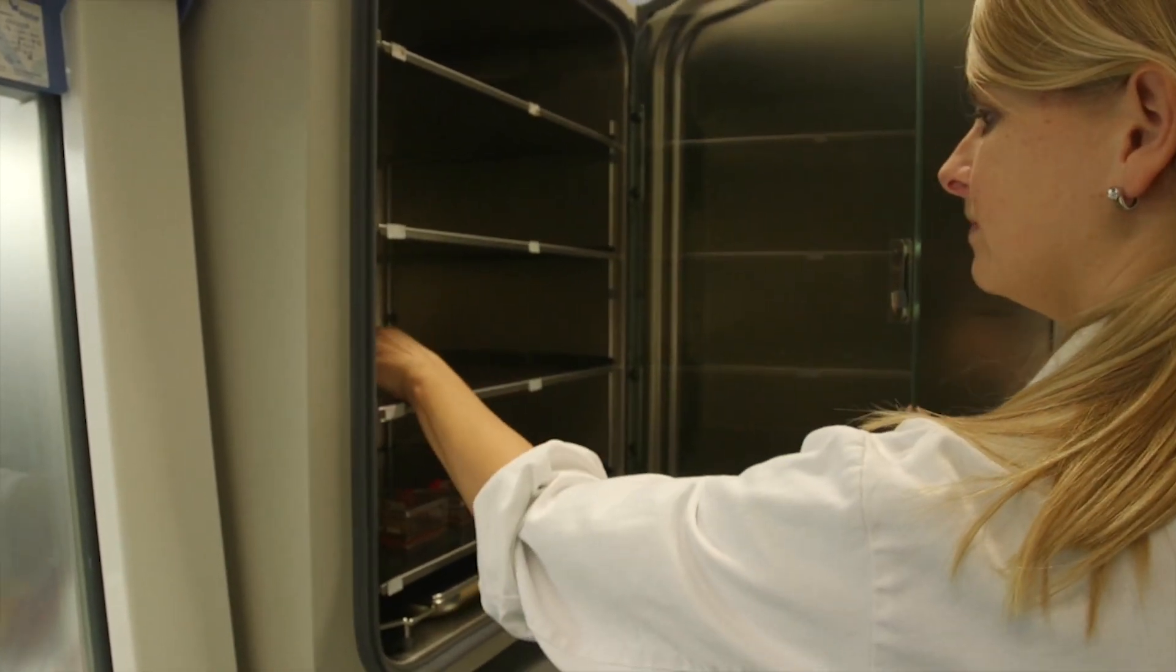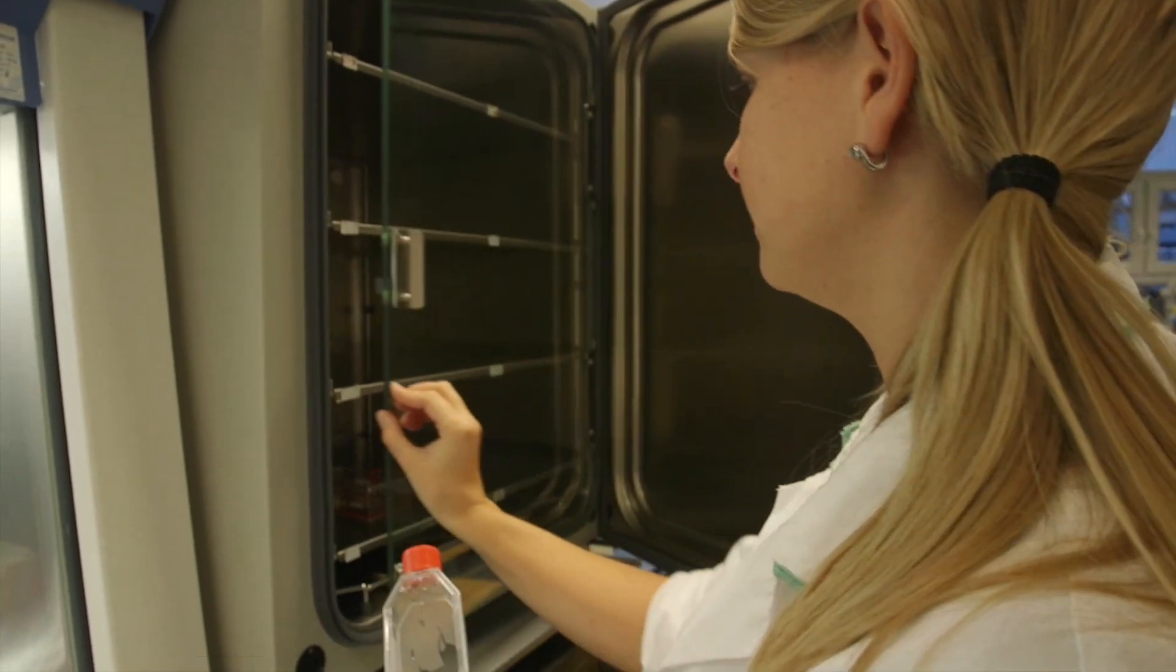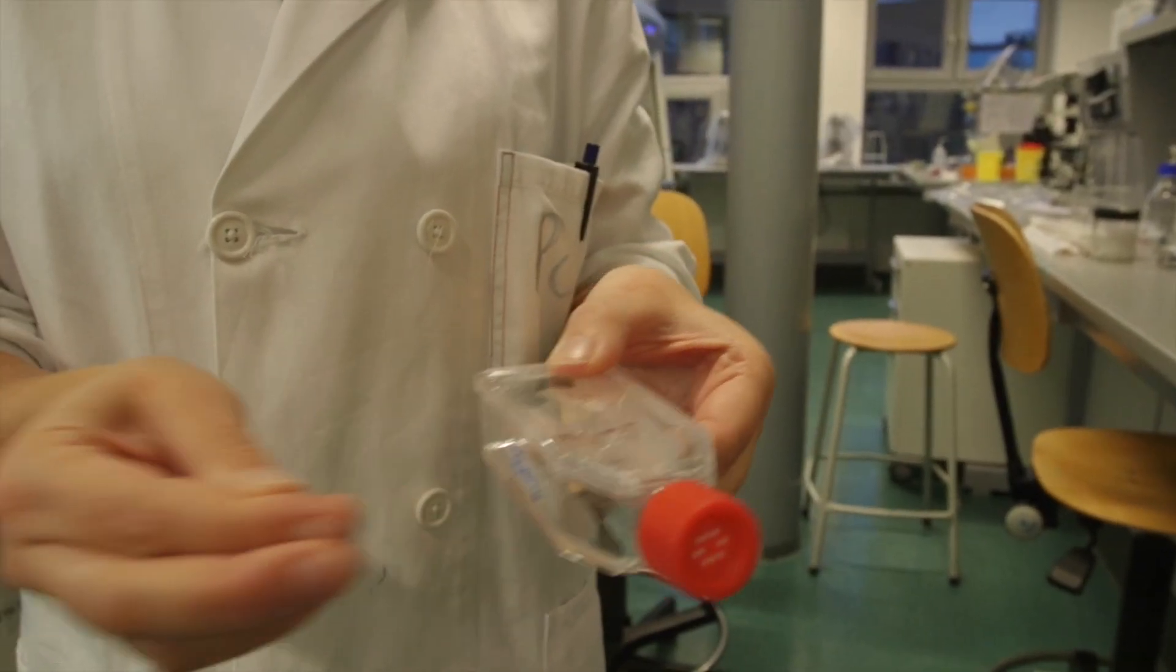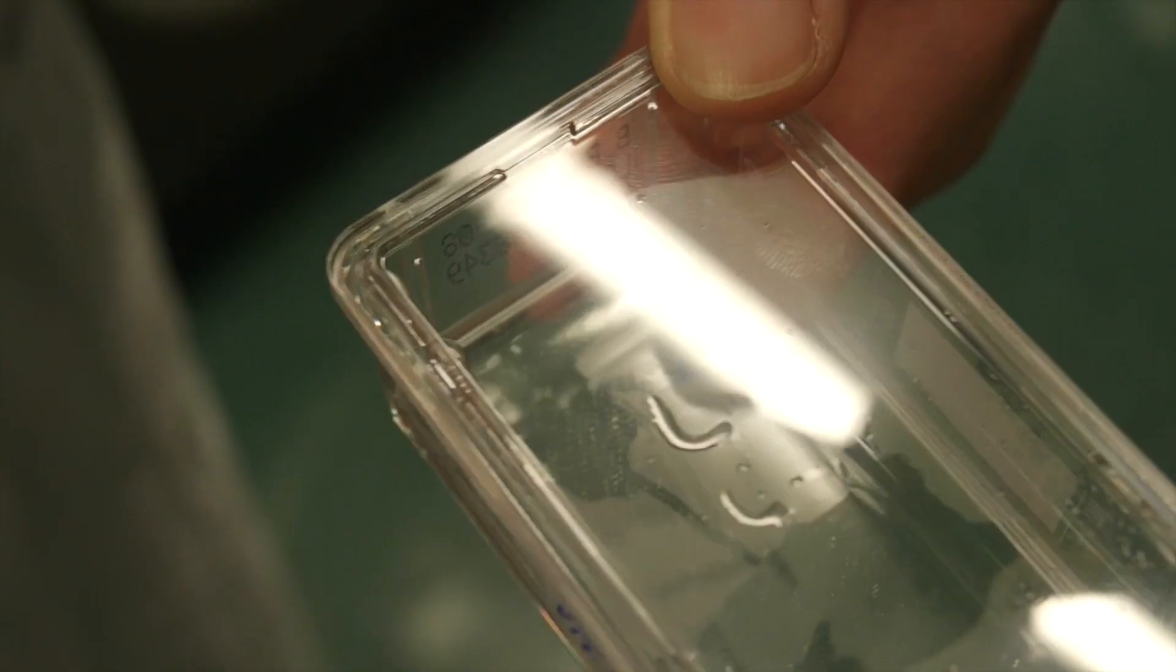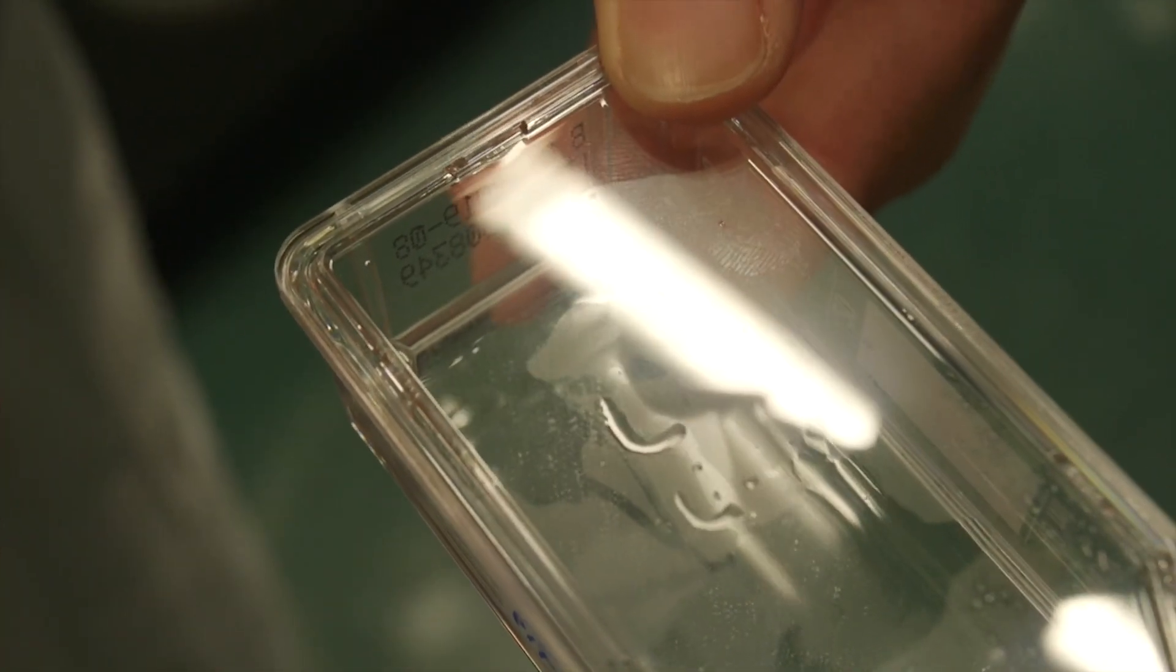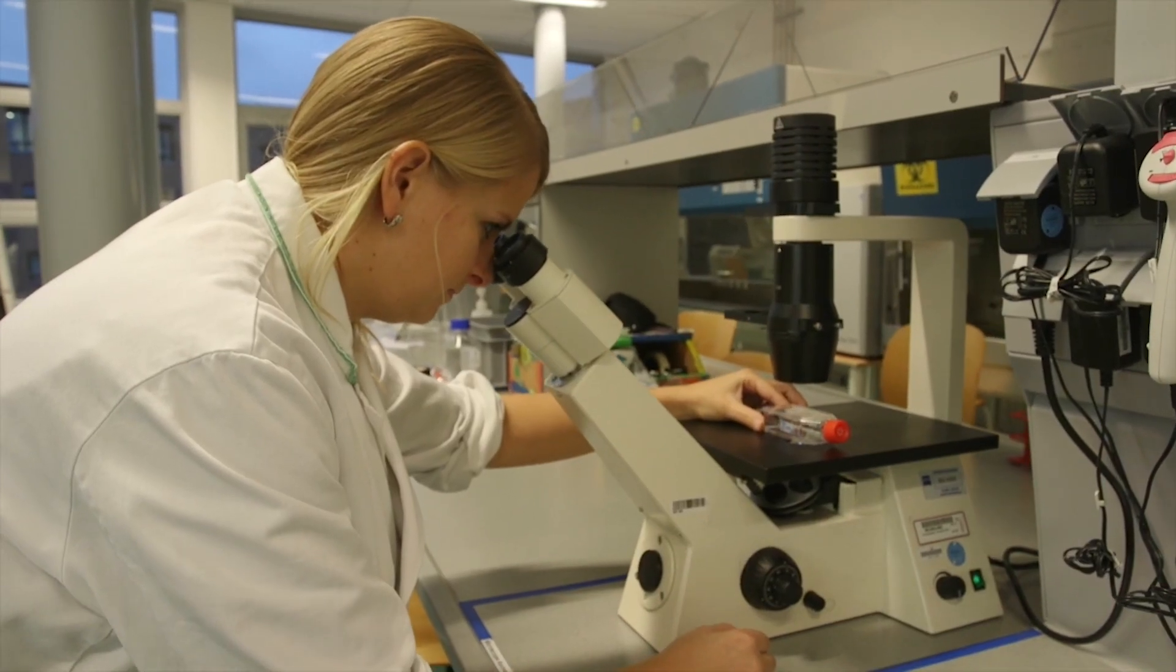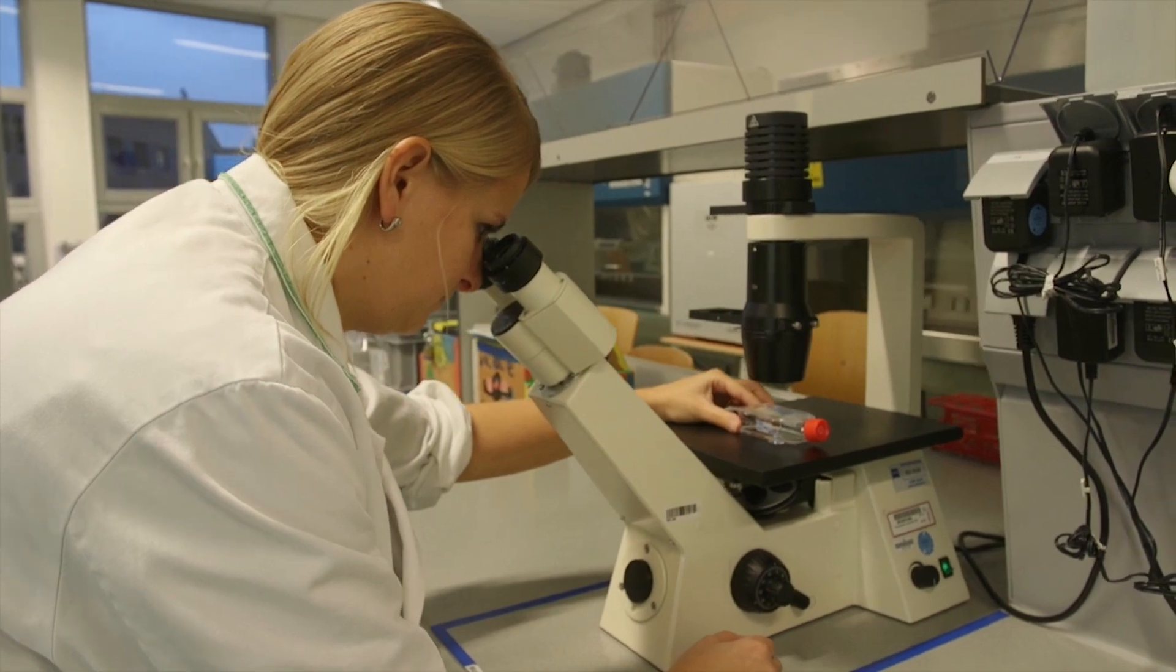After about 1 minute incubation, remove the flask from the incubator. To loosen the adhesions between the cells and the flask, tap firmly a few times against the side of the flask. With the naked eye, you should be able to see cells detaching from the bottom. Look at the cells through the inverted microscope. All cells must be detached from each other and from the bottom of the flask.